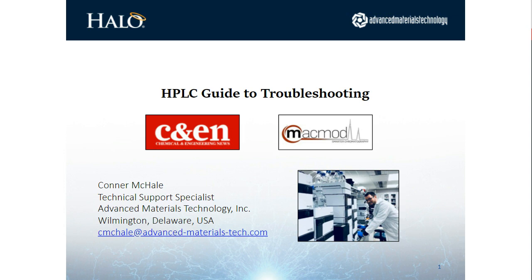Great, thank you very much, Ann. So today's presentation will be just an HPLC guide to troubleshooting. All chromatographers, whether you're just getting into the business or you've been doing it for years, troubleshooting techniques can be really useful. So I'm hoping that this webinar covers a few things that you'll take home with you and hopefully help you troubleshoot your HPLC in the future.